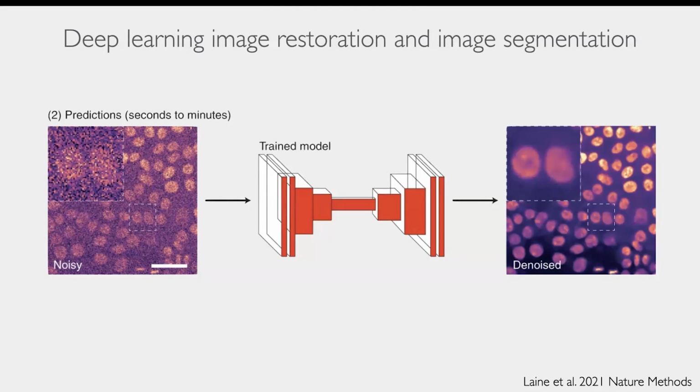And I think these are just critical tools for research now, because many of you may be working on live imaging projects where you need to image quickly, or you don't want to damage a cell or affect how the normal biological processes in that cell. Or maybe you're on an older confocal and you want to image a large amount of tissue, and it's just not possible without getting very noisy images. And so image restoration provides a solution for those kinds of problems.